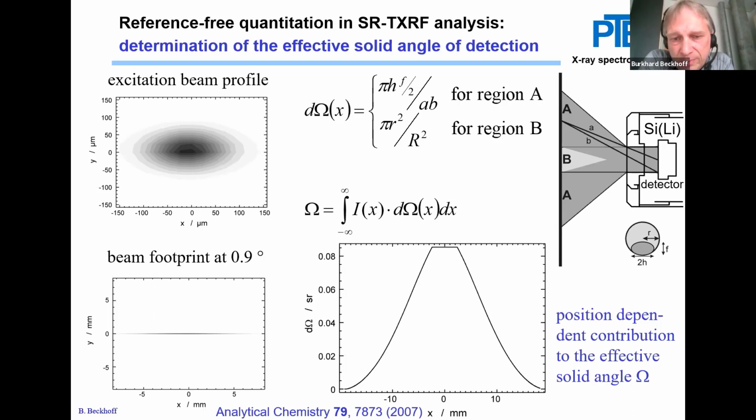And this function is important because whatever you put below the detector has a position-sensitive efficiency. So imagine that you put a small dried residuum at position 0. You have the maximum efficiency in this case.